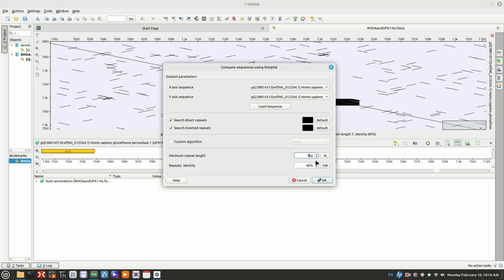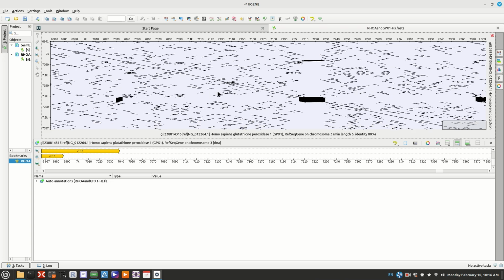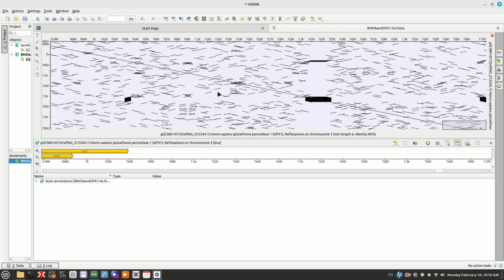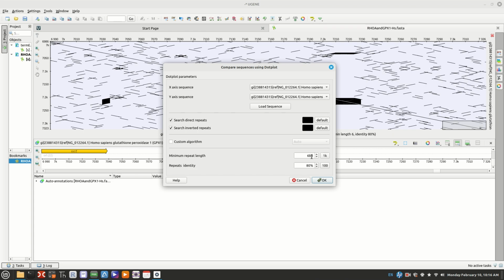Let's lower this one more. Get some here, get some up here. Get a lot of them in here, actually. Yeah, this might be a really complex loop. Oh yeah, I see them after this. I was looking at this darker piece, but that darker piece is just probably a long stretch of T's or A's. And the hairpin loop, though, looks to be around here somewhere. You could find something in this for sure. But of course, we don't know for sure.